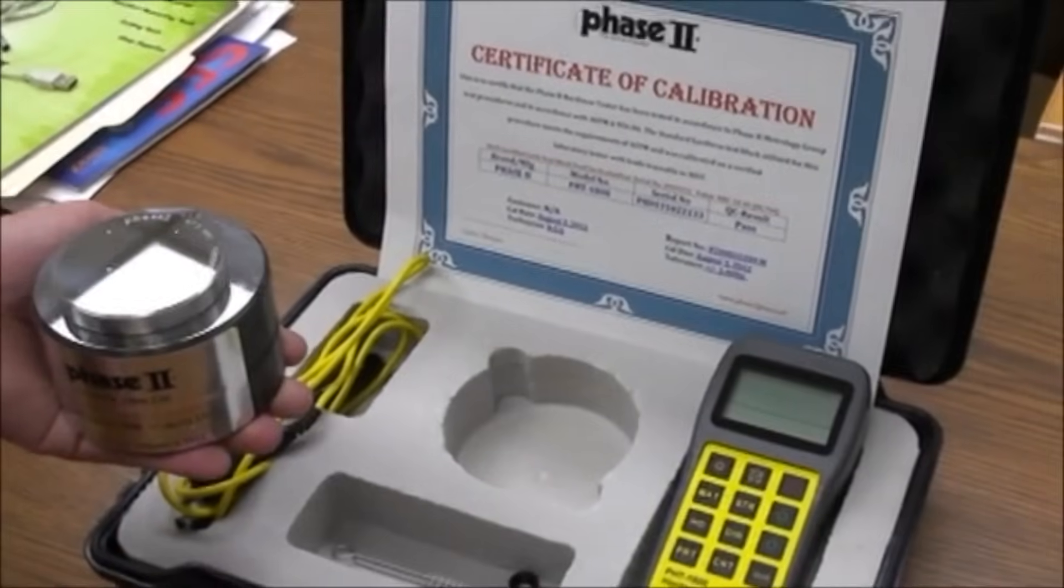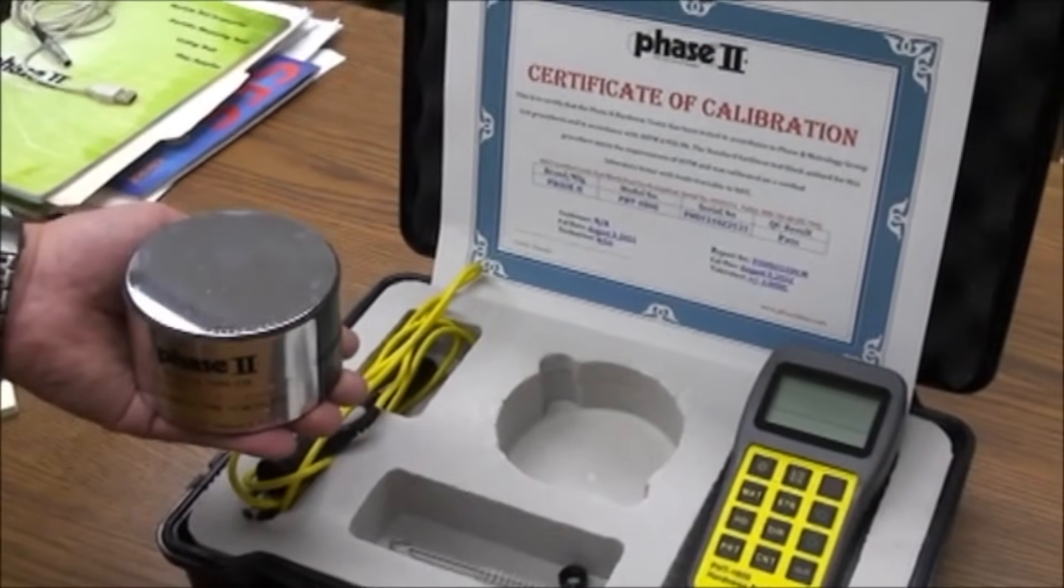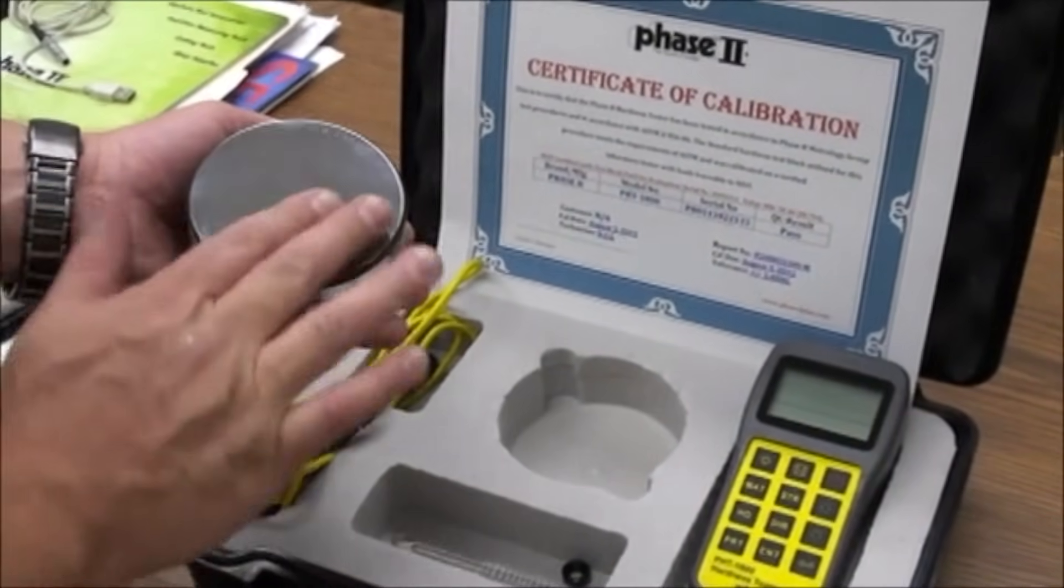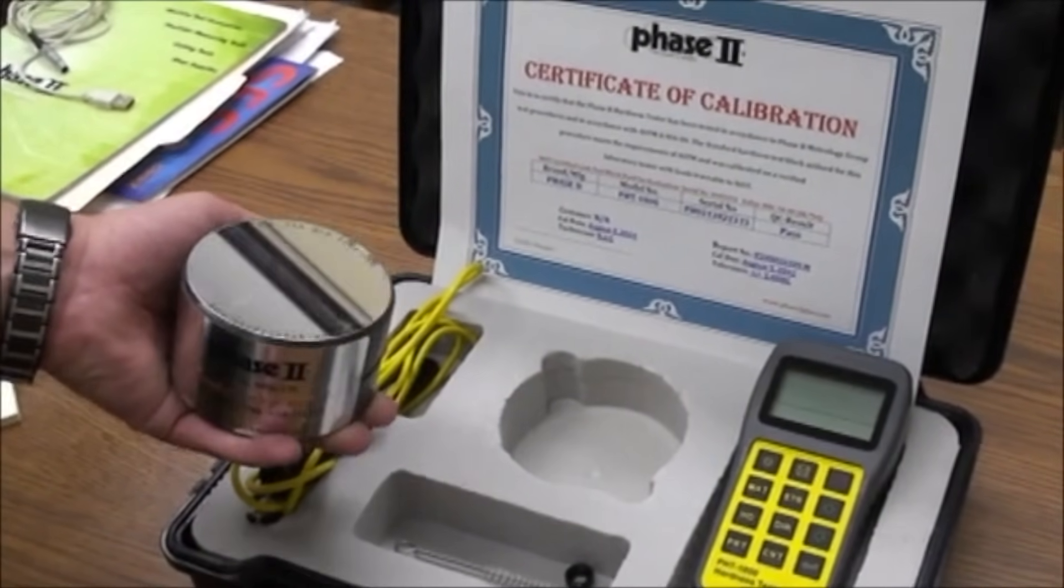The next parameter is surface roughness. Surface roughness should average a 2 micron or 80 micro-inch finish or better using the standard impact probe. Optional probes such as the G-Probe can handle rougher surfaces such as on rough castings.